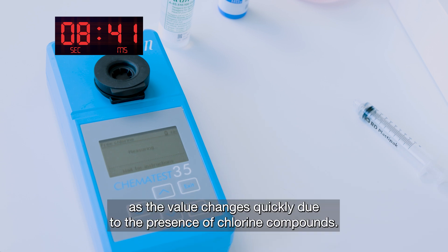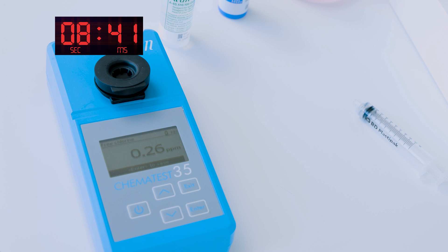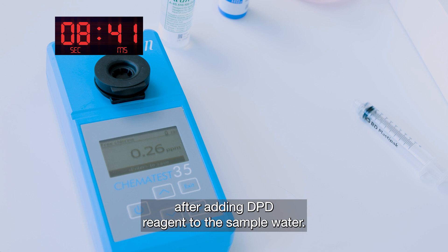It's crucial to be fast as the value changes quickly due to the presence of chlorine compounds. Here, the manual measurement was launched 8 seconds after adding DPD reagent to the sample water.